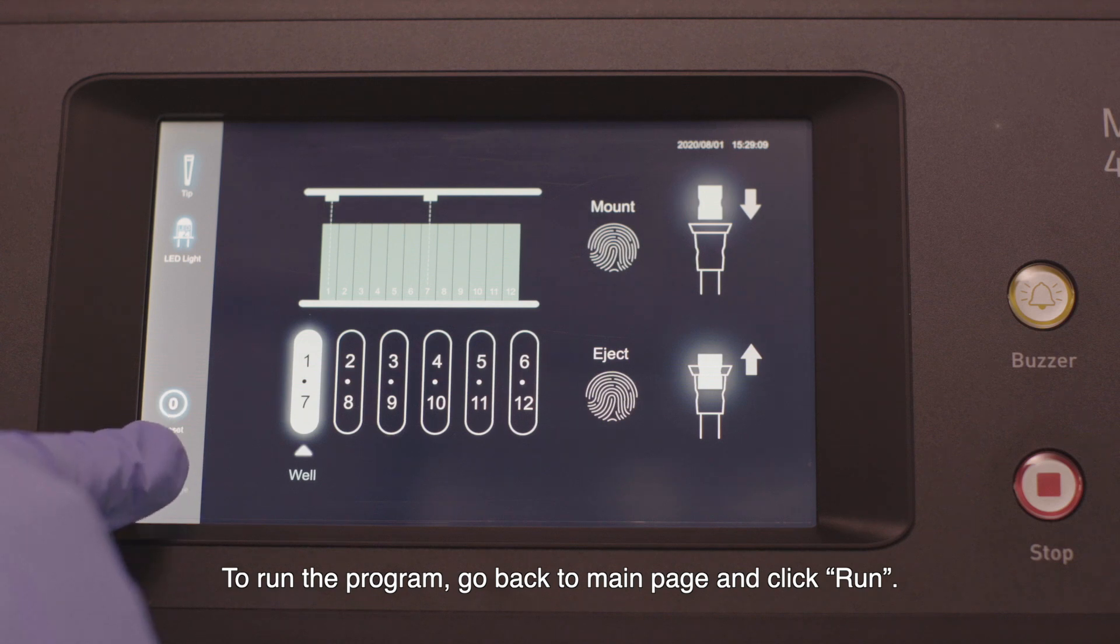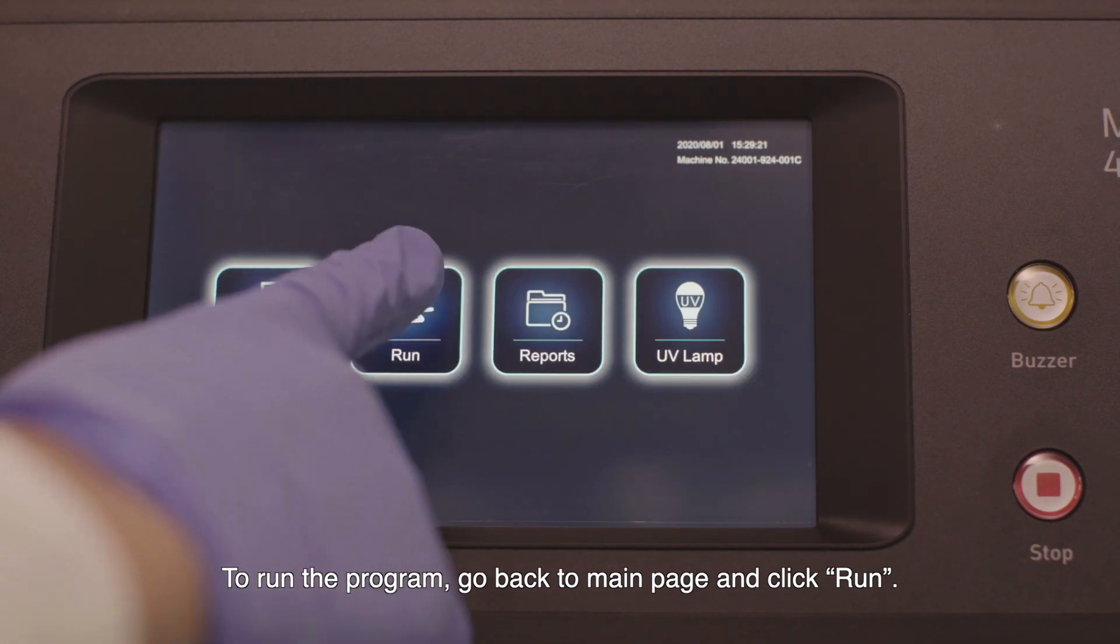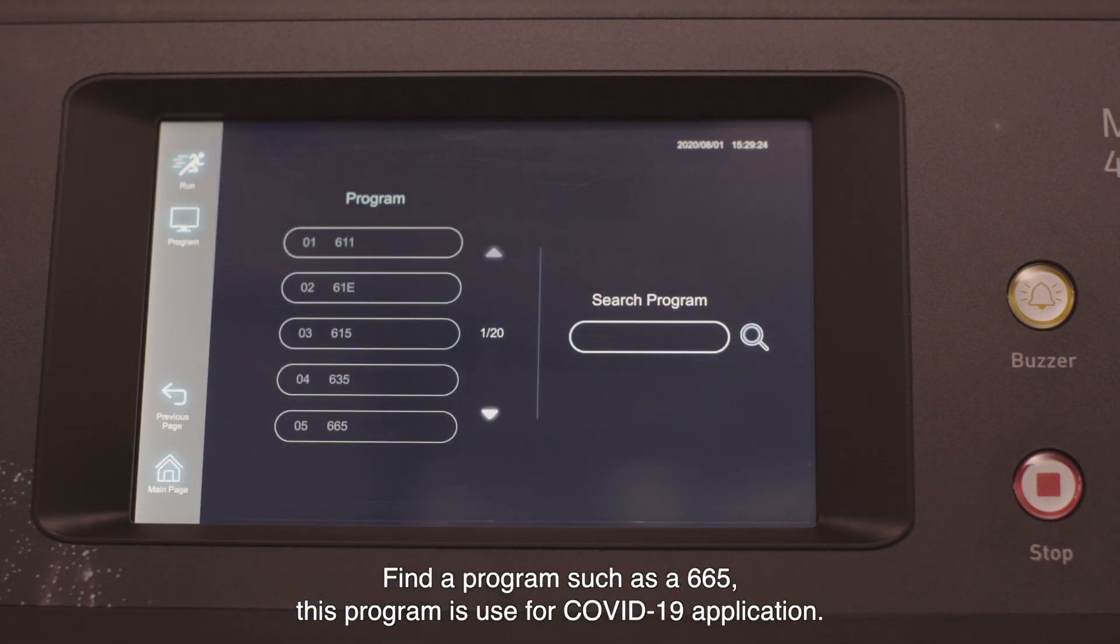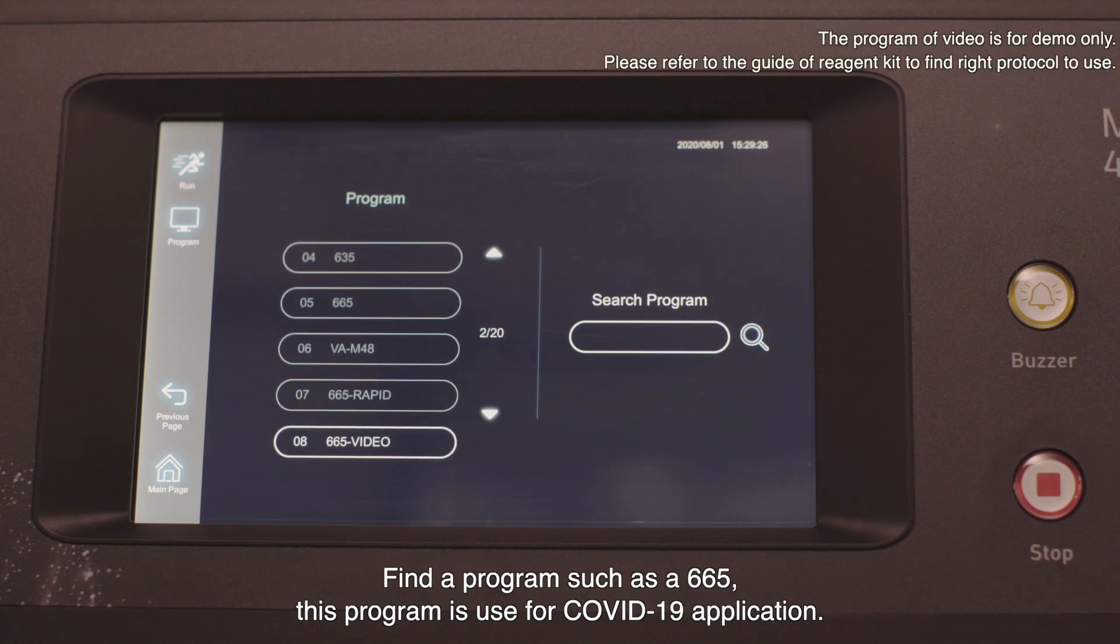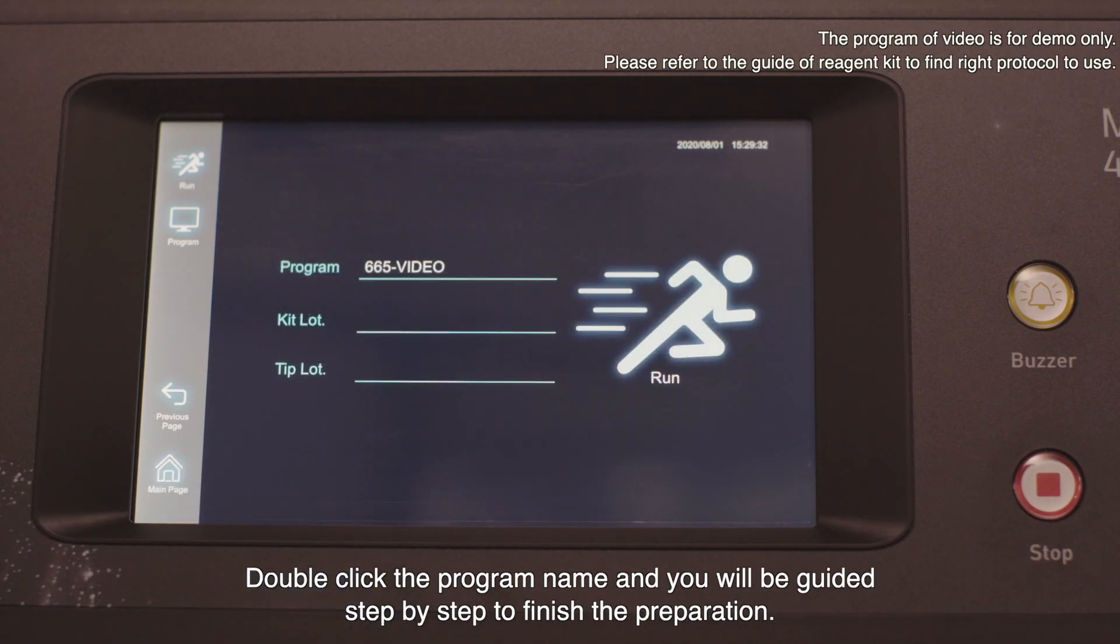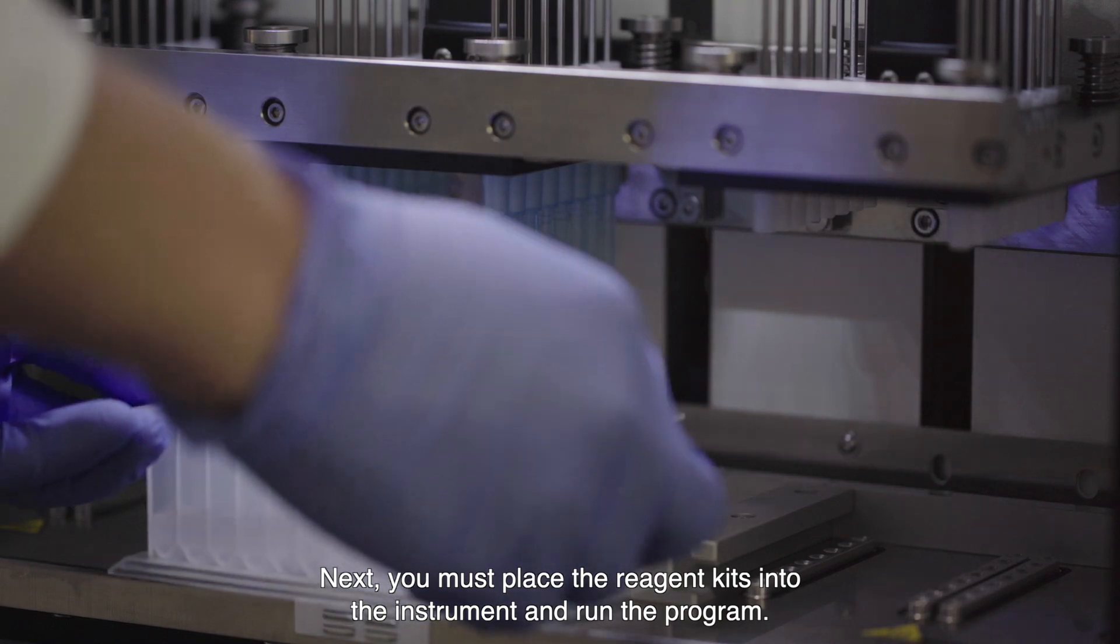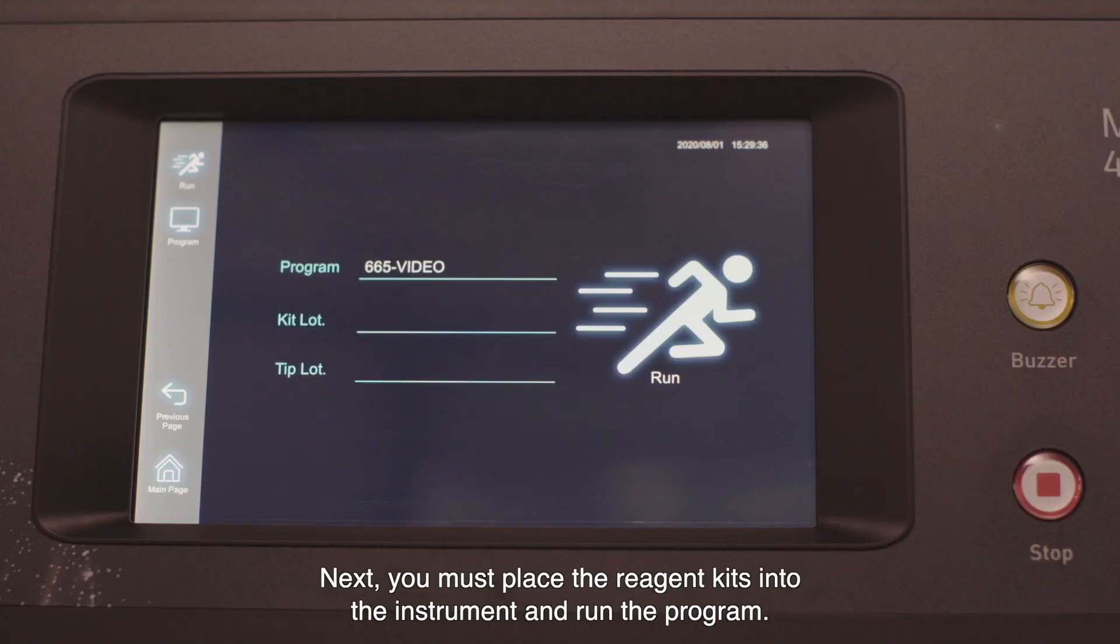To run the program, go back to the main page and click run. Find a program such as the 665. This program is used for COVID-19 application. Double click the program name and you will be guided step by step to finish the preparation. Next you must place the reagent kits into the instrument and run the program.